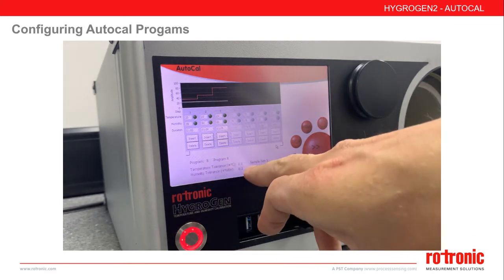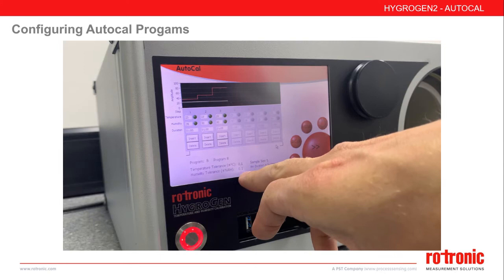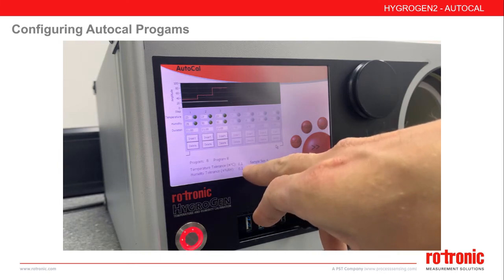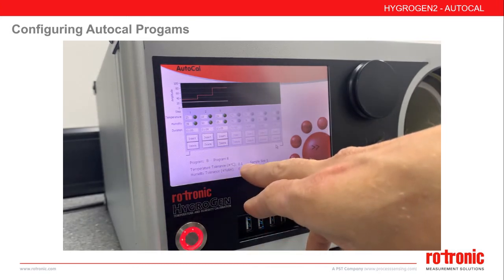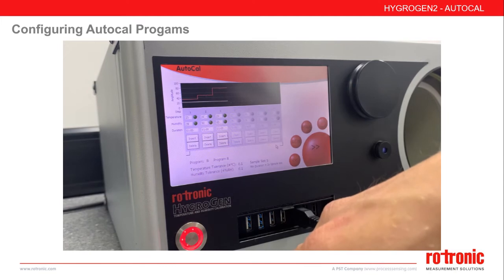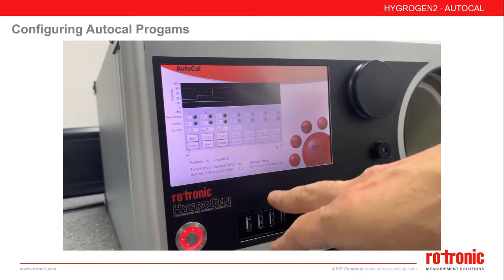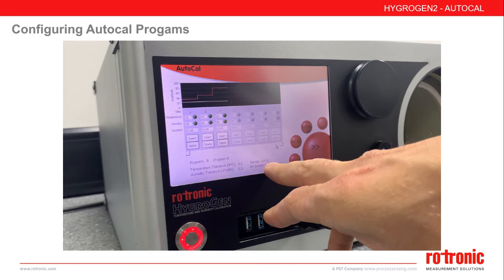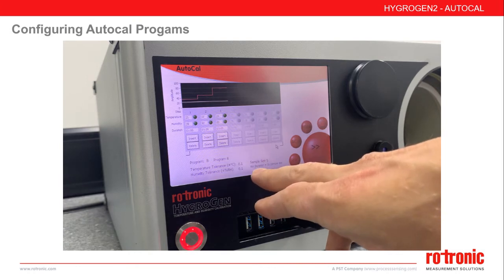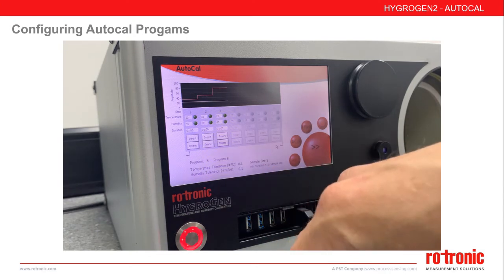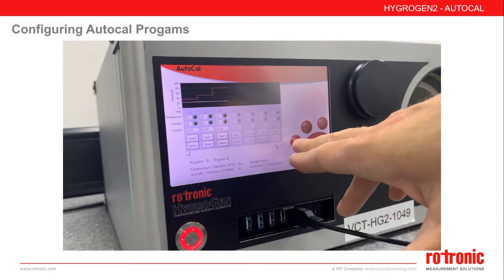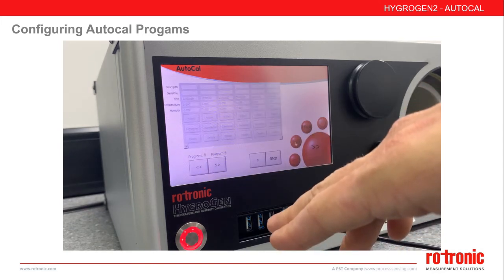We can edit the program name below. In addition, we have the standard temperature and humidity tolerances to control the program time — once within the specified tolerance, the countdown will begin. Additionally for AutoCal, we have a sample size number, which is the number of readings recorded at the end of the set point. This detail will be saved on your certificate and is vital for providing stability information. Once completed, return to the main AutoCal screen.